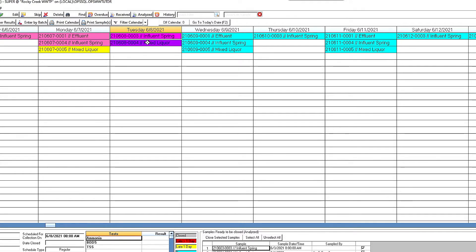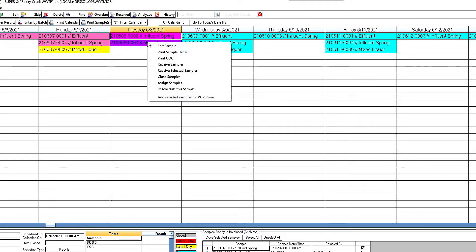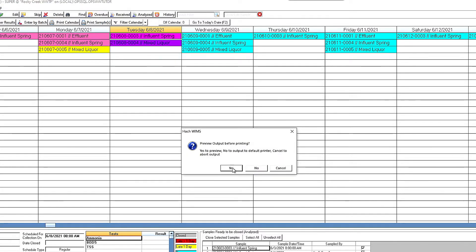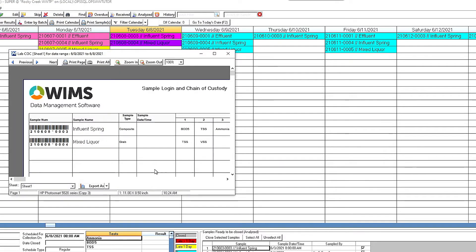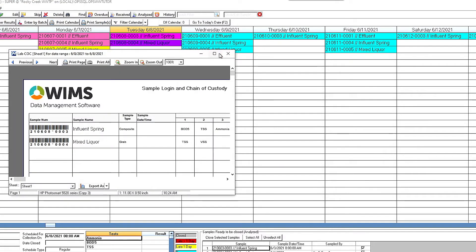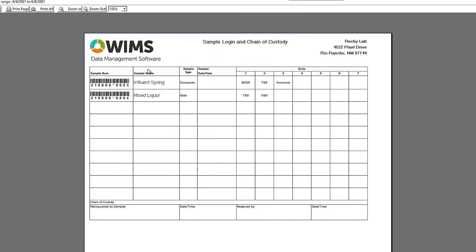So the first thing would be I'm going to highlight these samples, and I'm going to print the chain of custody. So I'm going to bring this report up, and this report is customizable. If you know WIMS, you're going to know how to set up a report like this, and it's going to identify the samples that you need to take today.